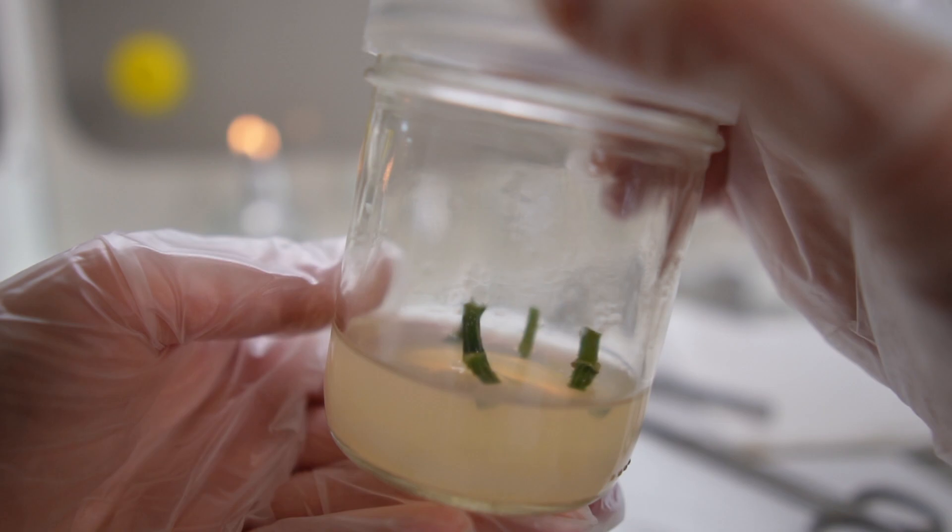After about six weeks I will subculture these plants and transfer them into new multiplication media using the exact same recipe. After another eight weeks or so they'll go into rooting media. The rooting media recipe is similar but I'll reduce TDZ to none or very little, since TDZ is a cytokinin that promotes multiplication. In the rooting stage we want more auxins, so I'll double the NAA to 0.4 or 0.5 milliliters per liter.